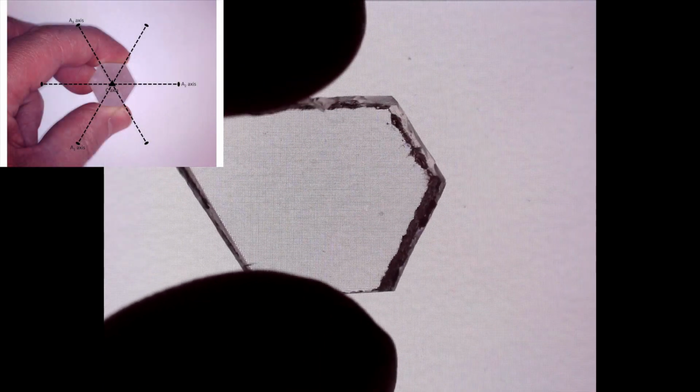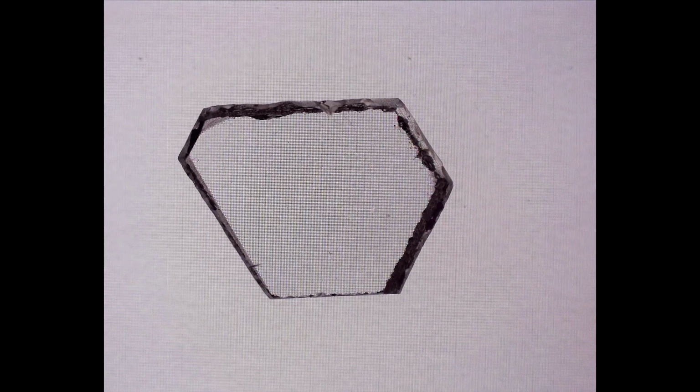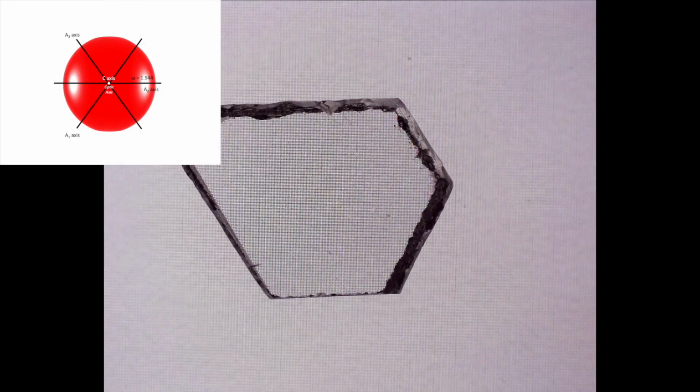And this time we're going to view our quartz slice with crossed polarizers. But first, let's bring in the optical indicatrix, and we can talk about theoretically what should happen when we bring in our upper polarizer. Because our plane polarized light can only ever interact with refractive index omega in this view through our quartz crystal, essentially when we bring in our upper polarizer, the quartz should remain extinct, and should remain so when rotating our quartz crystal with crossed polarizers.